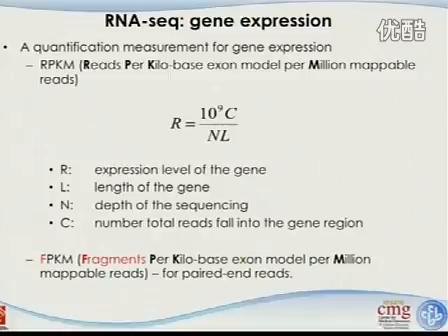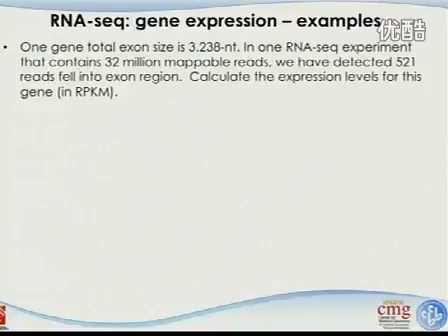Okay? And later, with the paired-end reads, people talk about FPKM, and it stands for fragments per kilobase exon model per million mappable reads. Basically, they are the same thing, just one for the single end, the other one for the paired end.